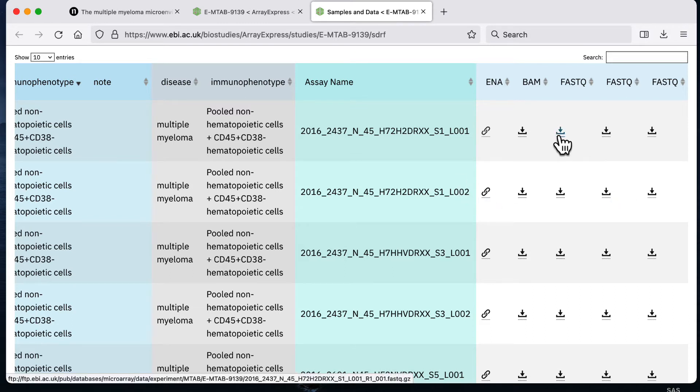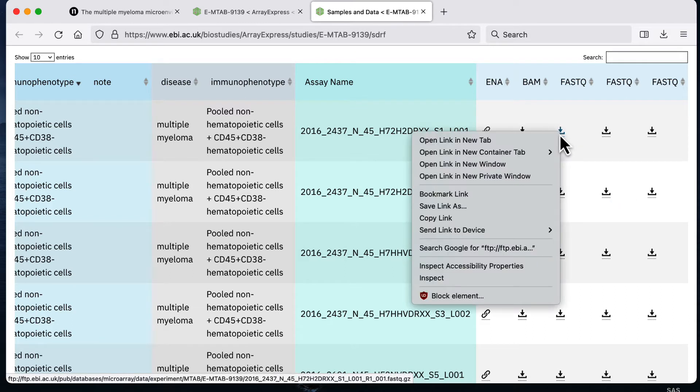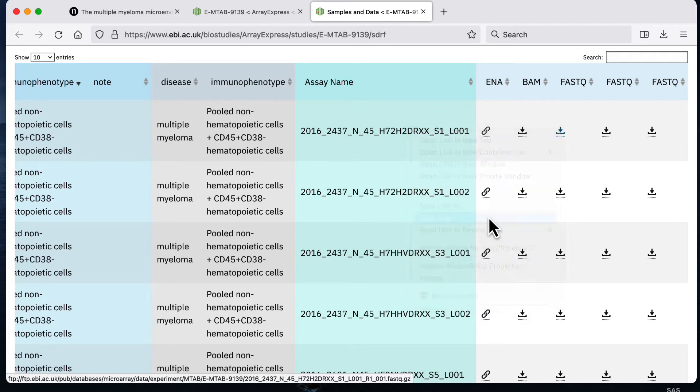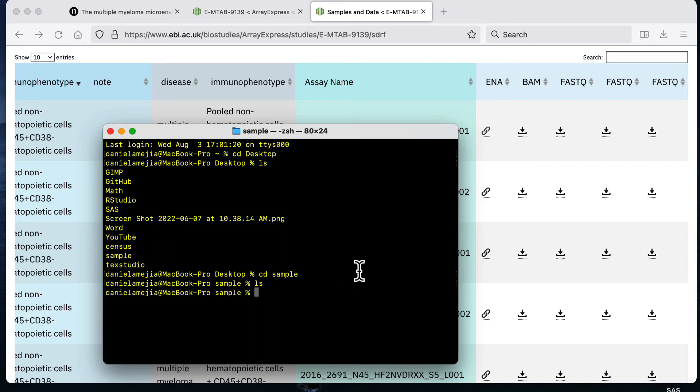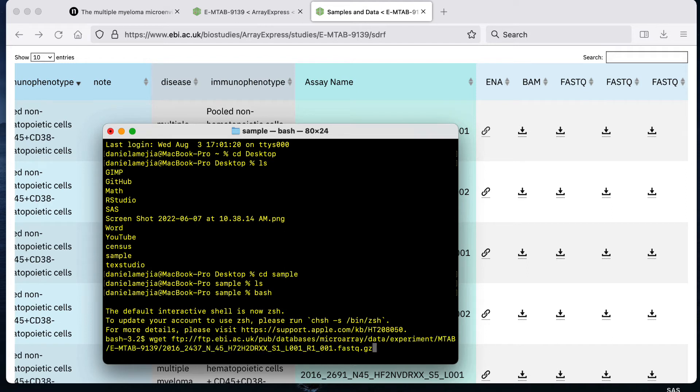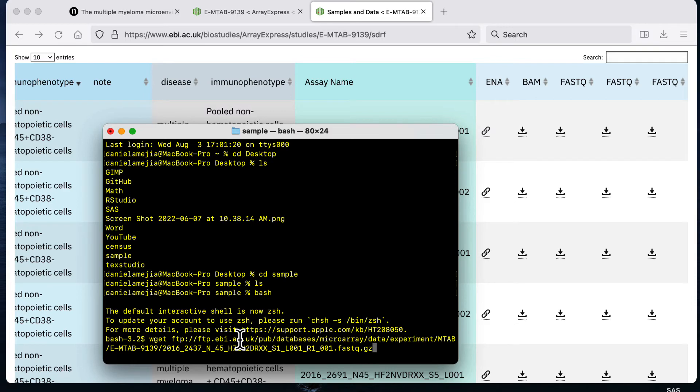For each of these six files I'm going to right click on the icon and I'm going to click copy link. That's going to give me the link to download the data. Then going back to my terminal, let's say that I'm on a Linux server that uses bash. The command to download the data from the internet is going to be wget and then I'm going to paste the link to the FTP website that has the data.